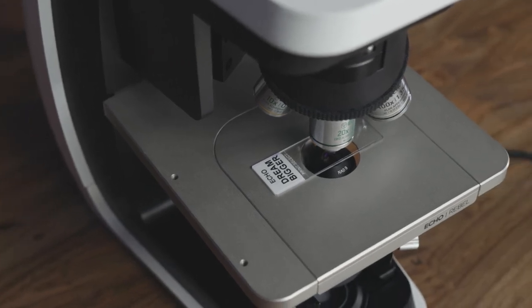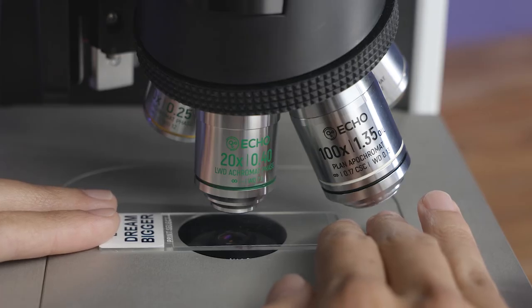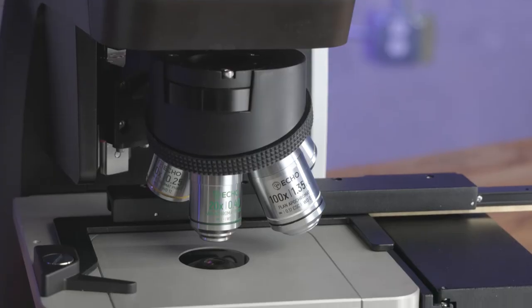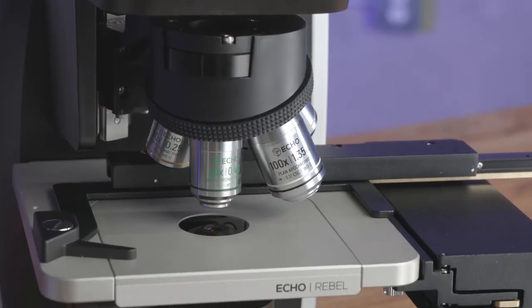REBEL comes standard with a plain stage, and users can push their samples manually by hand. And for more precision XY control, we offer two different stages.